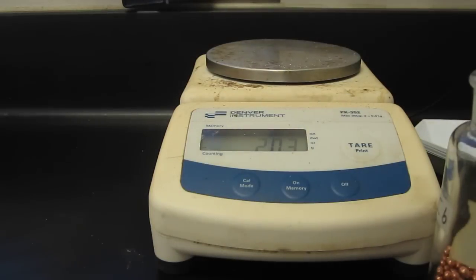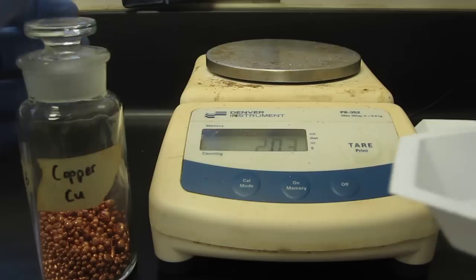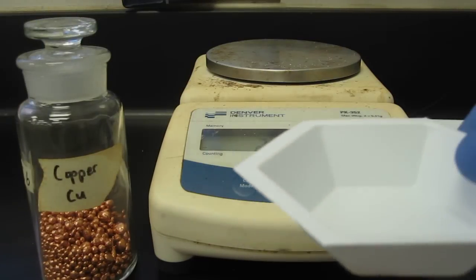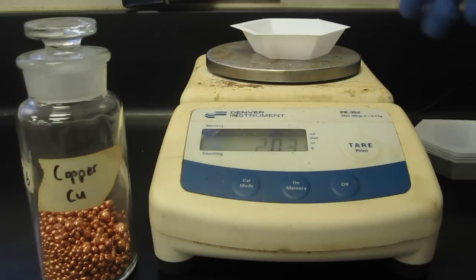so there's 8 pieces or 8 little copper shots in there and that's an exact number. There is exactly 8 of them because I counted them 1, 2, 3, 4, 5. Now we're going to put them on the balance.